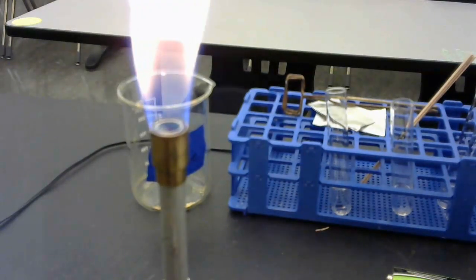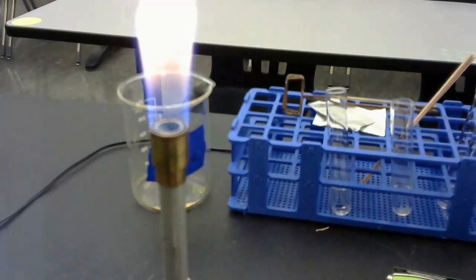So I'm going to turn on my scale and find the mass of that. While I'm doing that, I'm going to read all of the instructions because everything happens pretty quickly. It says heat the sodium hydrogen carbonate in the test tube for 1 minute. Observe any changes that occurred during the heating. Toward the end of the heating, light a wood splint and insert the flaming splint into the mouth of the test tube. Okay, so I'm going to record my mass here.